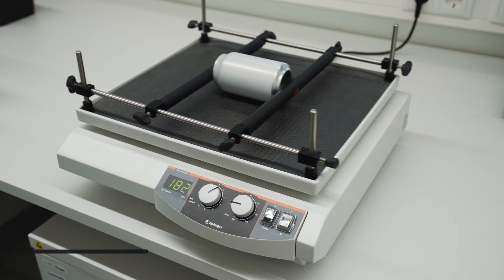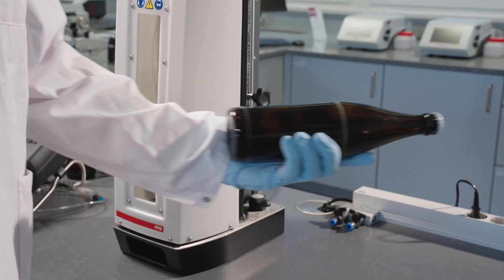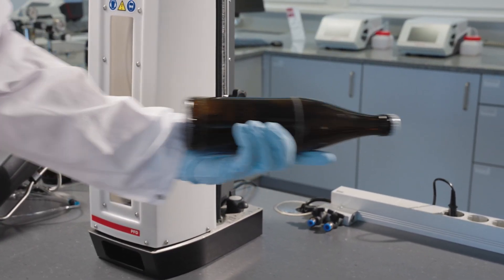For O2 measurement, shake for 3 minutes using a lab shaker. For CO2, shake the sample back and forth 15 times.